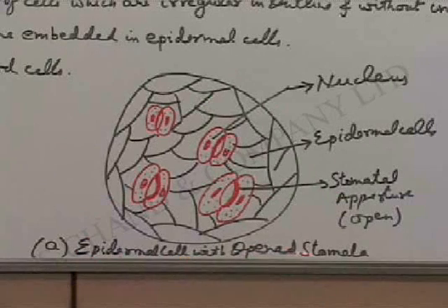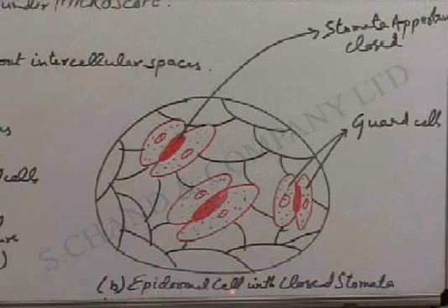Epidermal cell with open stomata — as you can see, this will be the nucleus, the epidermal cells here, and the stomatal aperture open. The epidermal cell with closed stomata — this is how we are going to view this under the microscope. The stomata aperture closed, and these on the sides are the guard cells.